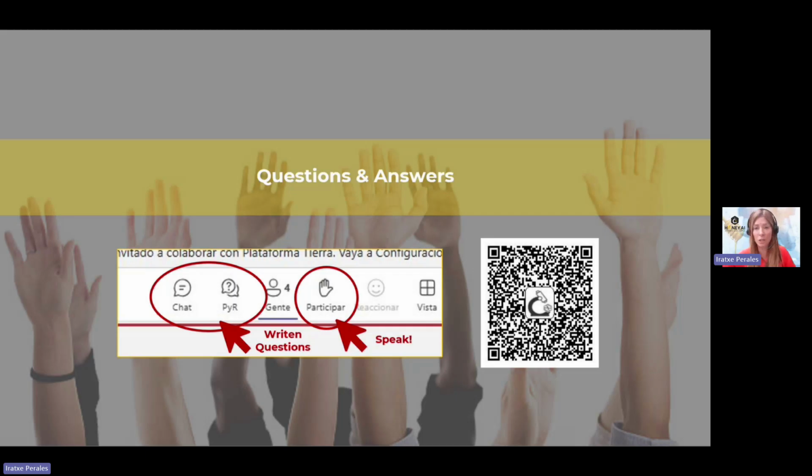We don't stain, but this is publicly announced. And we don't fix with gelatin. Again, this is publicly announced. So yes, we follow official protocols.